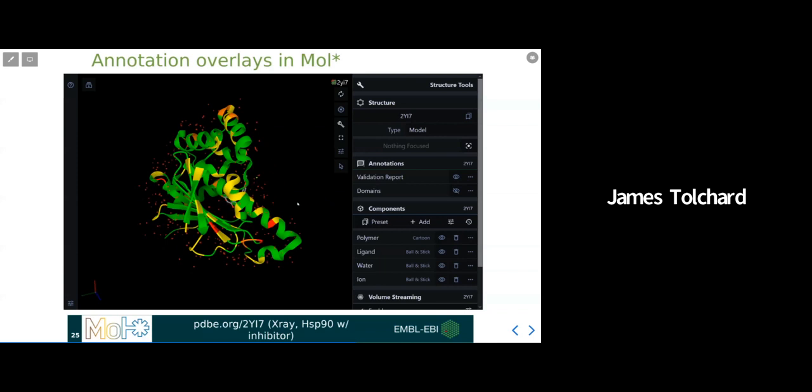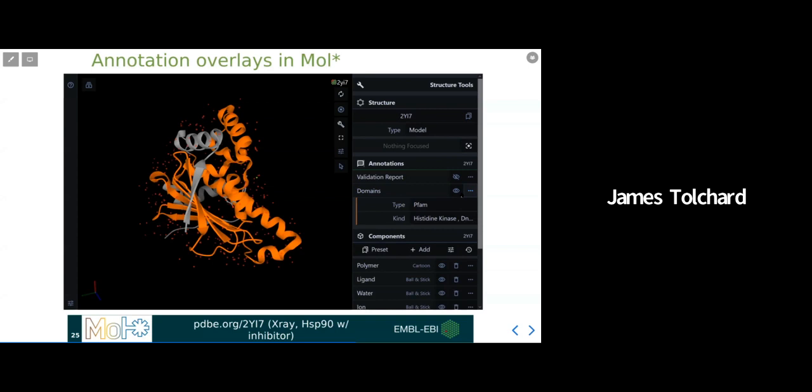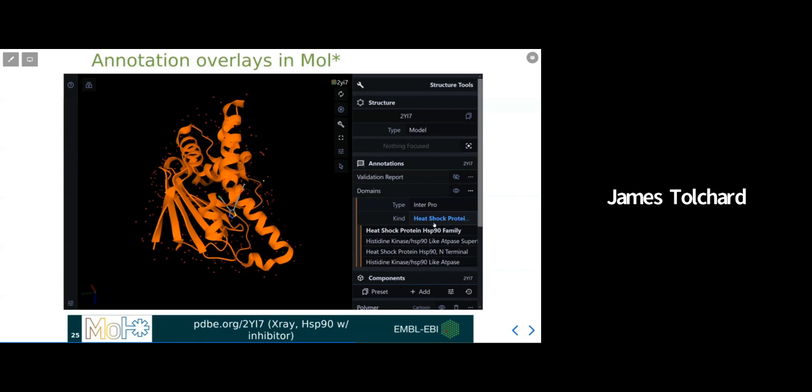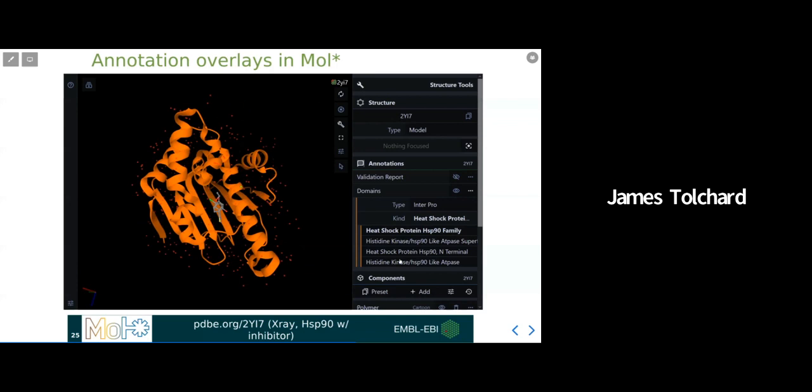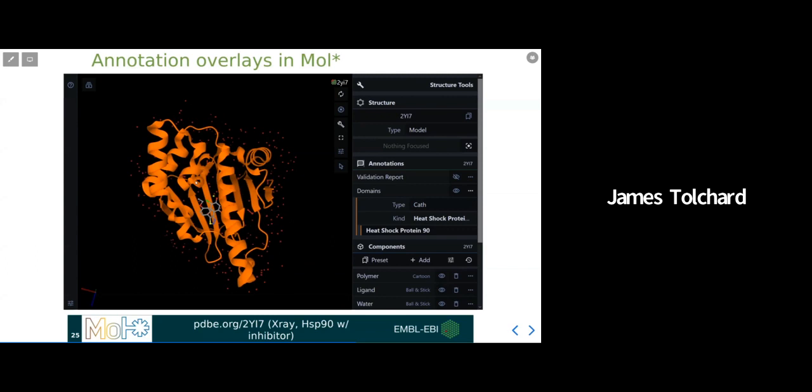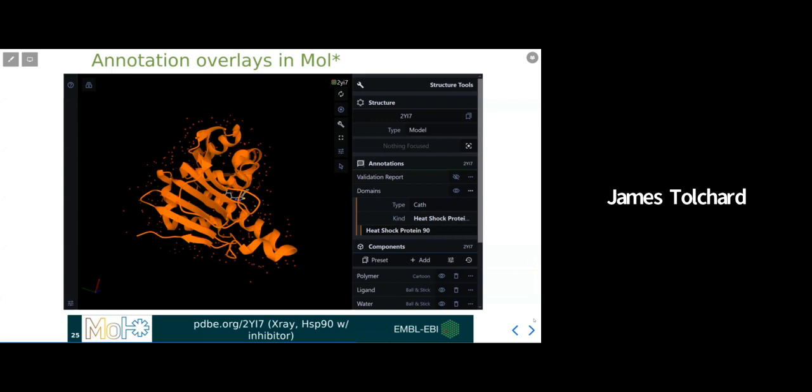If I turn that off for the validation report, here is where I can choose to show annotations from external services. PFAM, for example, with this selection now is highlighting the histidine kinase domain, as you can see in orange. Interpro option highlights the different subdivisions of functional families in HSP90. And the CATH structural annotation describes the whole heat shock protein 90 topology.